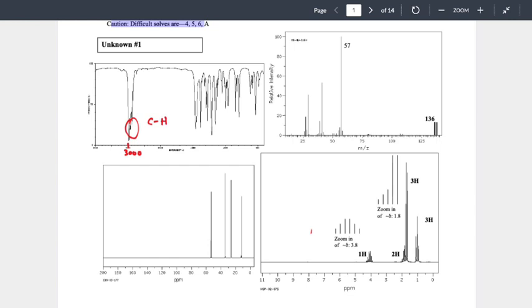A CH bond does represent that. Okay, well, what's going on? Well, IR provides electromagnetic spectrum energy. Ultraviolet and visible does the same thing. It provides electromagnetic energy. In ultraviolet-visible, when we hit a sample with that, that causes an electron to jump energy levels. IR is significantly lower in energy. So low, in fact, it can't even cause an electron to jump energy levels. Then what's the IR doing?